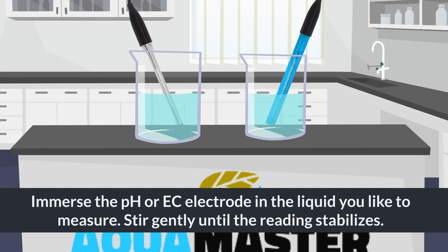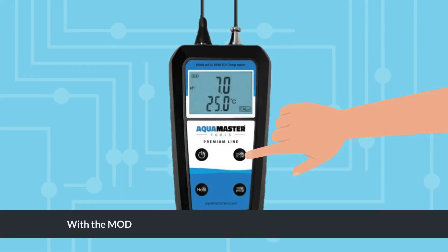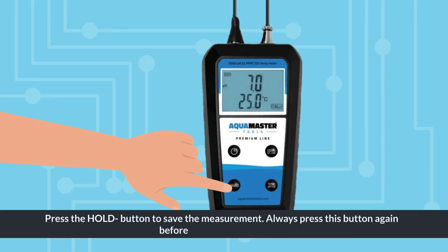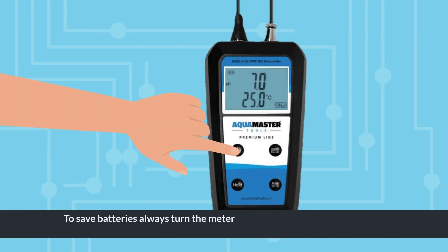Stir gently until the reading stabilizes. Press the temp button to switch between Celsius and Fahrenheit. With the mode button, you can switch between pH, EC, TDS, and PPM. Press the hold button to save the measurement. Always press this button again before taking a new measurement.